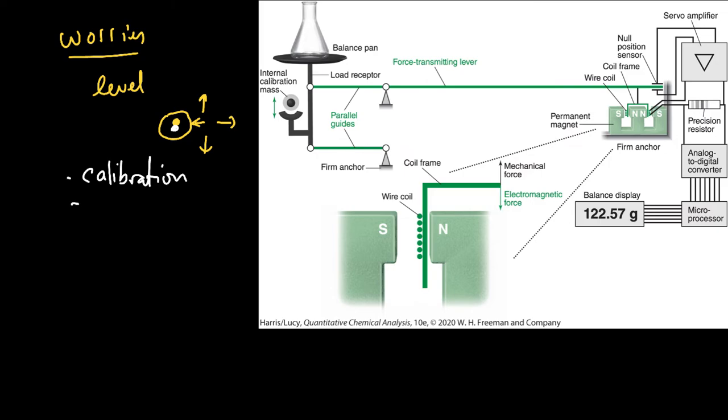Another problem when you're dealing with these analytical balances is that the fingerprints themselves have mass, and you need to make sure that when you're weighing anything, you're not leaving behind fingerprints. And so you have to use gloves or paper towels or kim wipes or something when you're transferring things on or off.